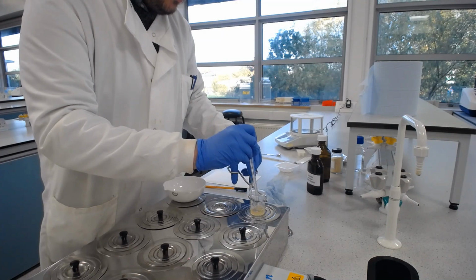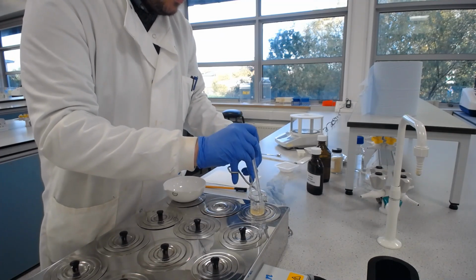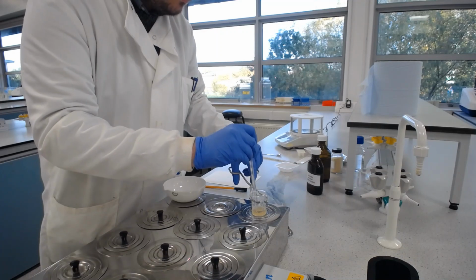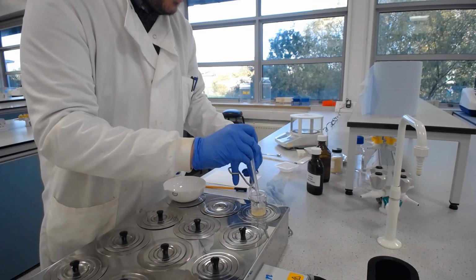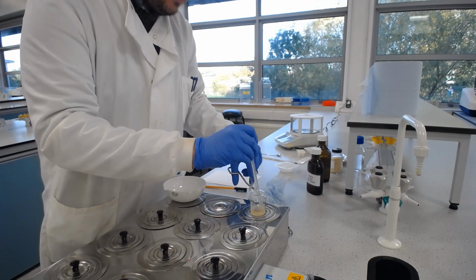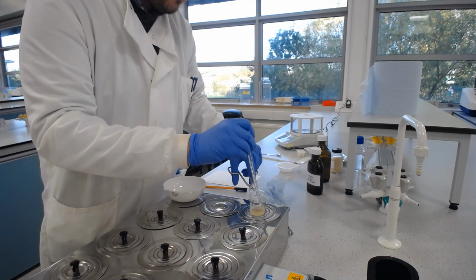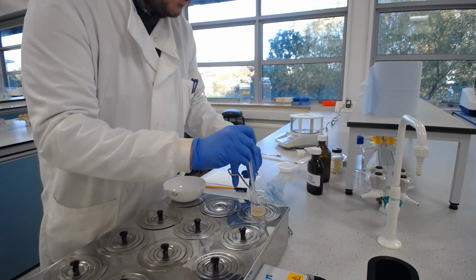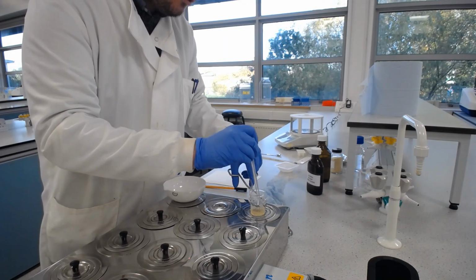Incidentally, you'll hear people say dissolving gelatin. We don't quite dissolve gelatin when we put it in. It is more somewhere between a suspension and a solution, because when it cools down, the big long chains of gelatin will cross-link with each other and be not quite in solution, and that's how we get our semi-solid, our gel formation. So cross-links between long chains is how we're going to be getting that gel forming.